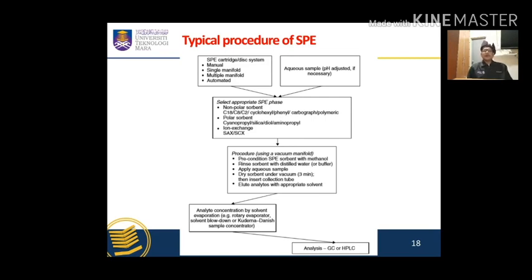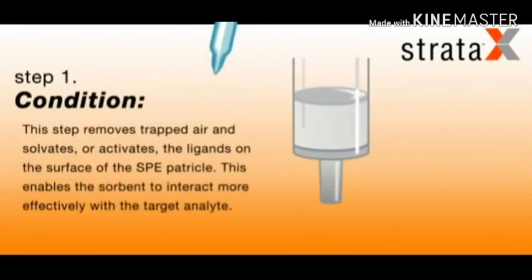This is the typical procedure of SPE. I hope this diagram could help the students to understand the SPE process. I also attach here an interesting video that I downloaded from YouTube to help you understand more regarding this SPE procedure. This video will show you the steps in SPE.